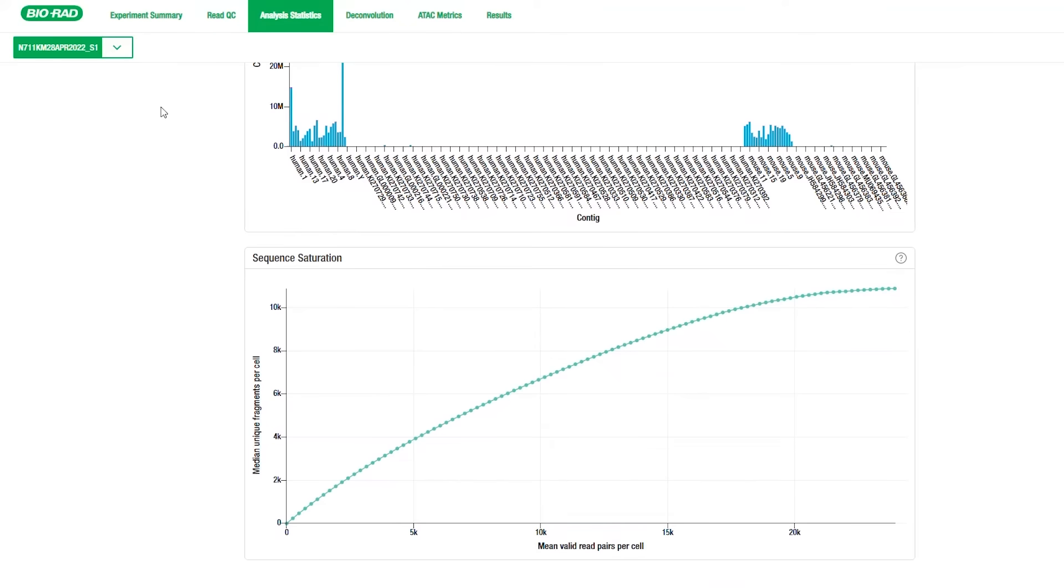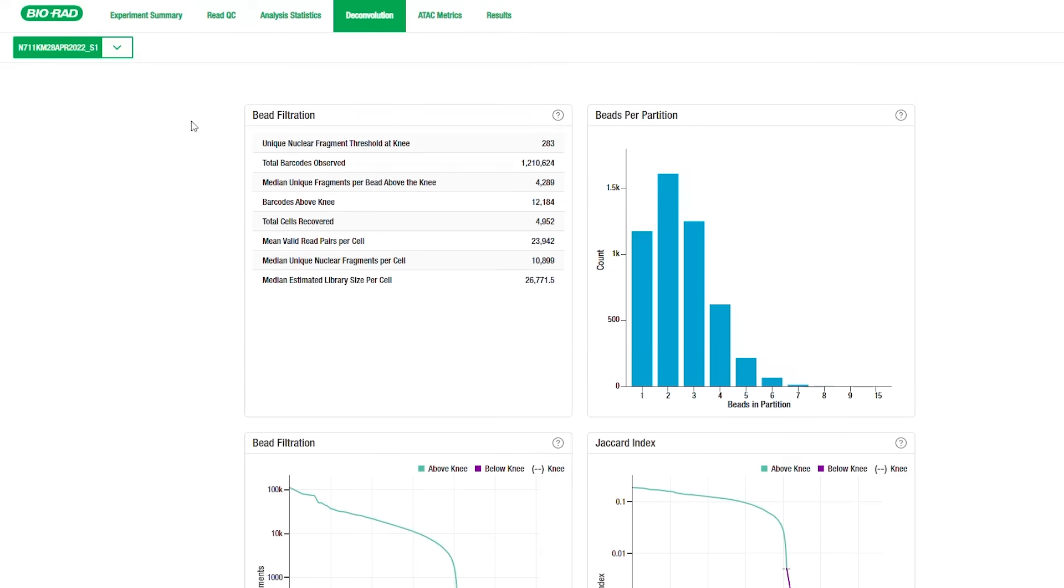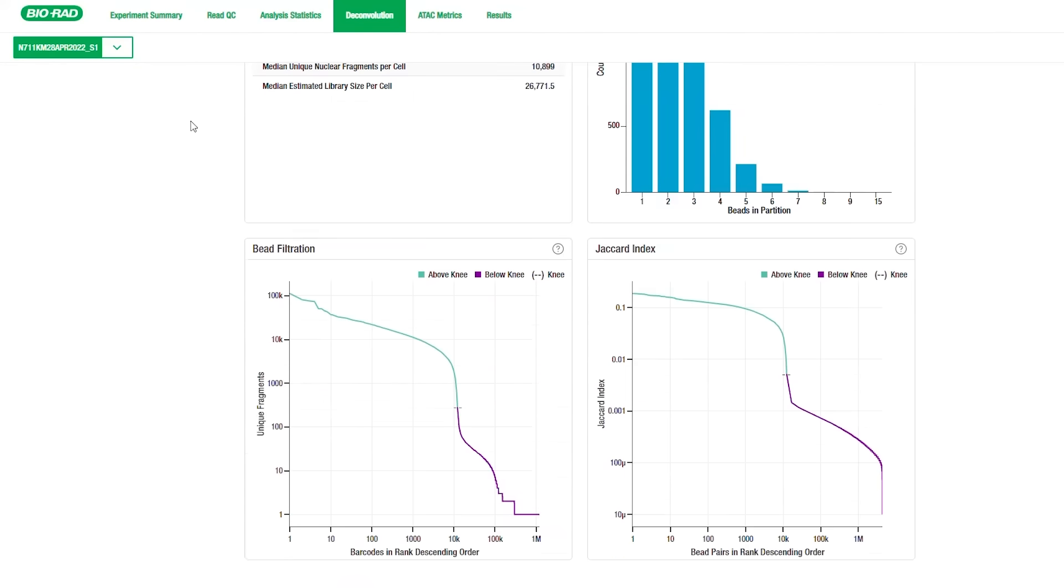The Deconvolution tab contains information on how well Omniscient was able to parse out all the sequenced barcodes and identify those that contain information from nuclei. This tab includes metrics on the outcome of bead filtration in both a table and graph as well as information about how many beads per partition were captured and how well beads with shared fragments were merged to bring the genomic information of an individual cell together.